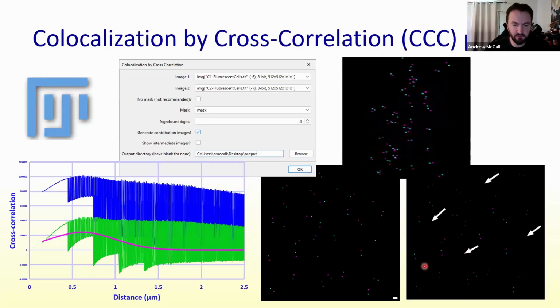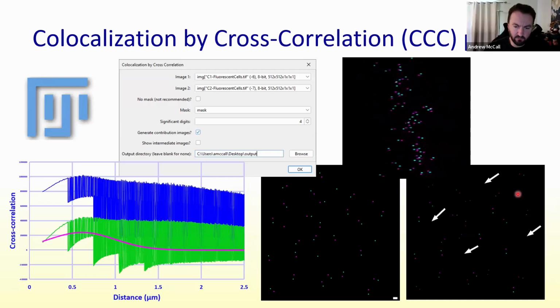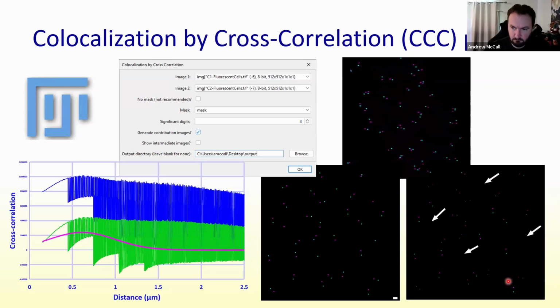The reason I call them contribution images is because if you have pairs that actually line up, those will be brighter than the ones that don't. So you can see in here, we have some matching pairs in terms of their angle, and those are brighter because they contributed more in that regard. And that comes from the cross-correlation result image.